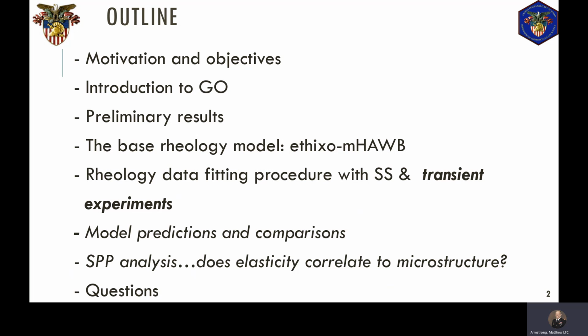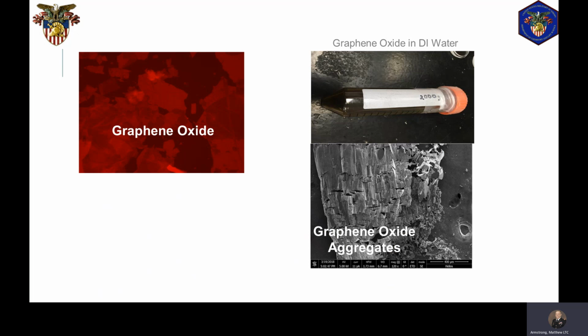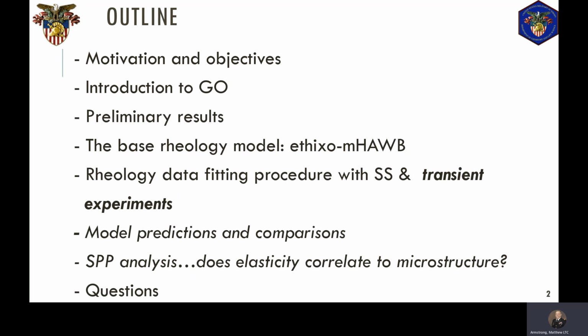Then we'll talk about the phase of the operation involving rheological data from the Aries G2 rheometer and fitting, and also the interpretation of what that fitting means and what it tells us about the material. And we'll talk about how the model is robust enough to make very solid predictions. And then we'll talk about our LAOS analysis framework, the series of physical processes.